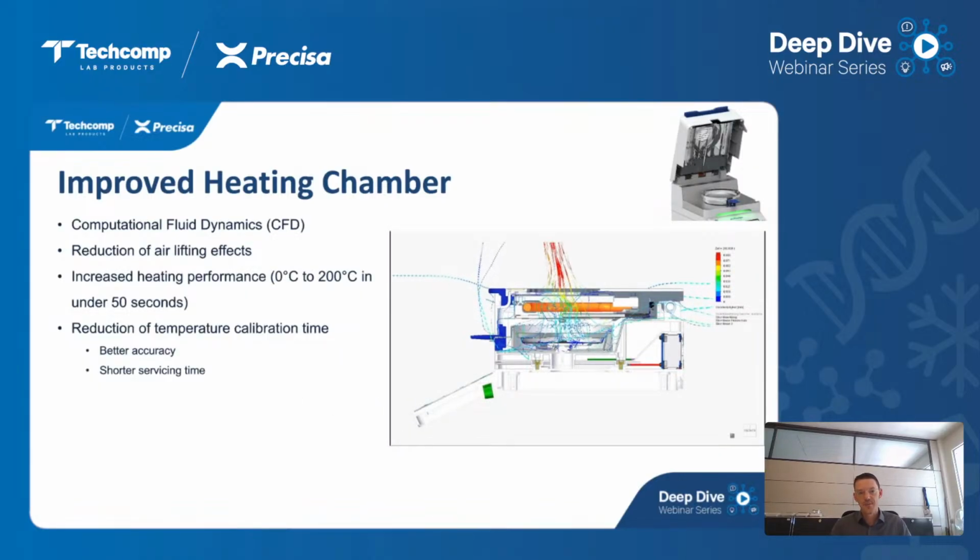Here, the shape and the behavior have been tested even before the prototype was realized. So this already gave us an idea how the final shape should look.